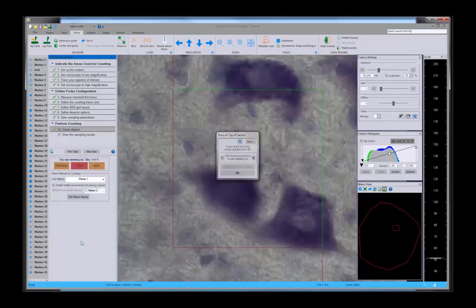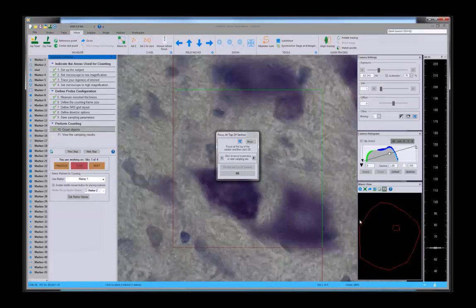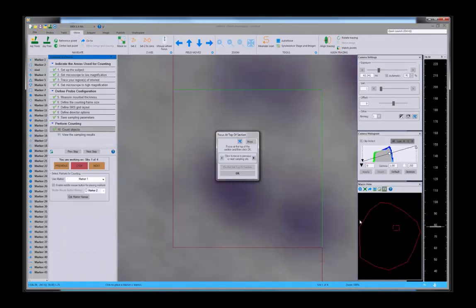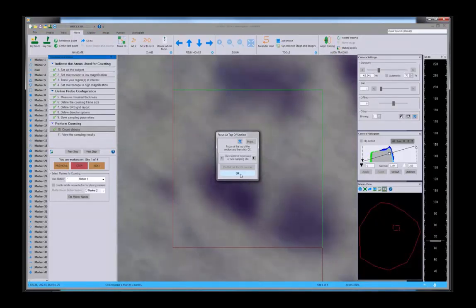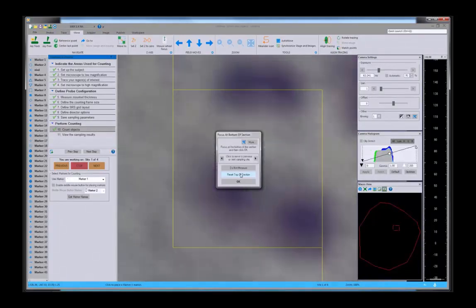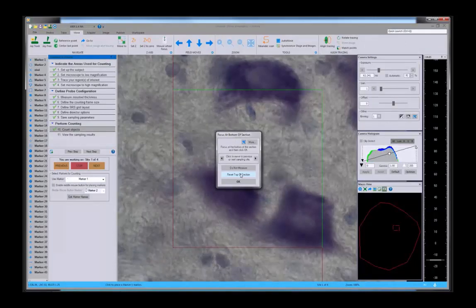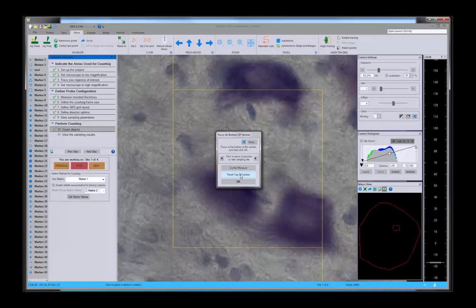We can see in the macro view this random start point, and the dialog box asks us, show me the top of the section. That's for the height fraction. So we focus to where everyone would agree we're out of focus. We come down and we say OK, I don't think it's quite there, but maybe there. I can see some rips in the top of the section. That's the top of the section. Now we focus to where we're out of focus on the bottom. We come back up, and then we make our last motion downward, and that's the bottom of the section.